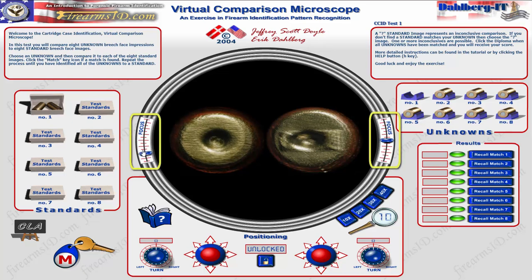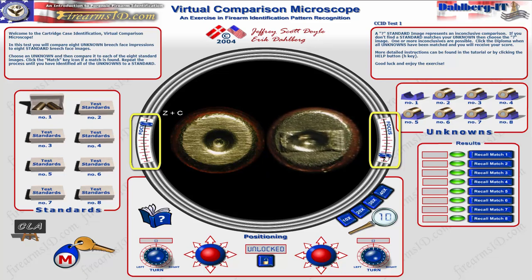On either side of the microscope you can find the focus adjustments, which you can click and drag. For the left side you can also use the Z and C keys on your keyboard. On the right side there's another focus knob for the right side, and you can use your mouse to click and drag, or use the slash or asterisk buttons on your keyboard.